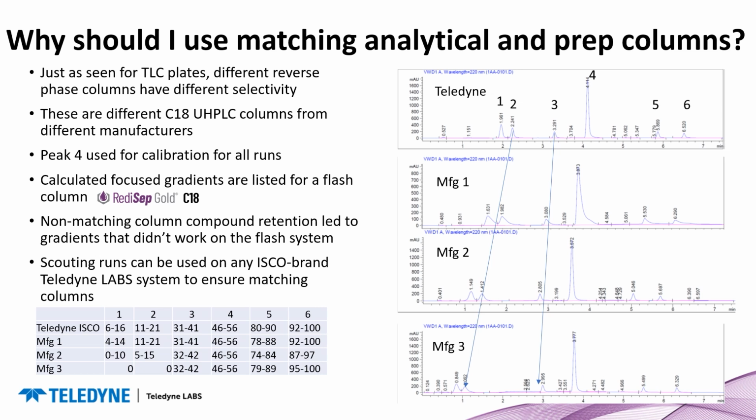Scouting runs can be used on any Teledyne ISCO lab system to ensure matching columns. In other words, you can run the scouting gradient on your prep system, and Teledyne ISCO also has matching analytical columns that match the C18 used for the flash columns.